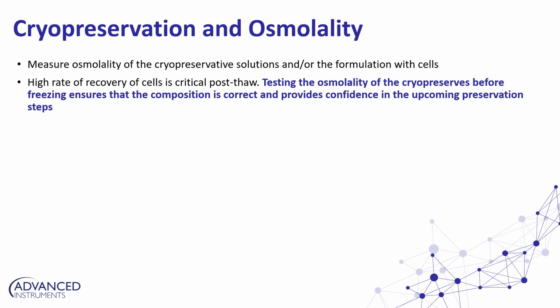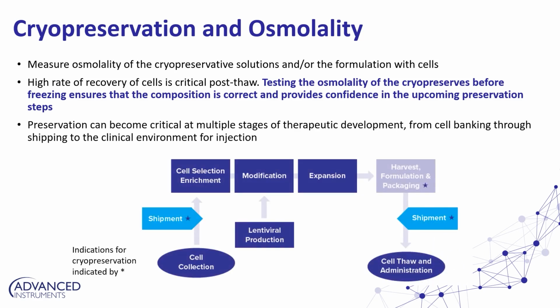As you all may be aware, some of the current vaccines for COVID-19 need to be stored at an ultra-low temperature to maintain integrity. This can be seen as a significant issue throughout the shipment process. However, cryopreservation may be one solution to this. As you can see from the graphic, osmolality can be applied at various times throughout the workflow, with big potential for those shipment phases.